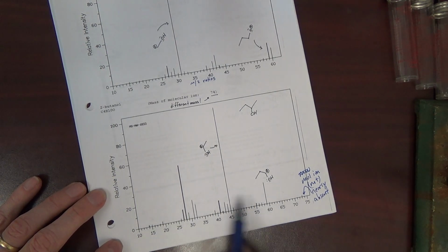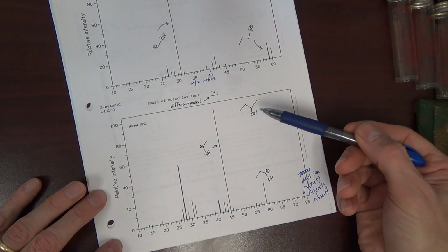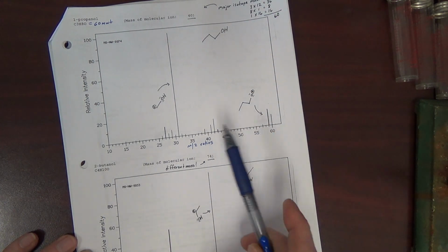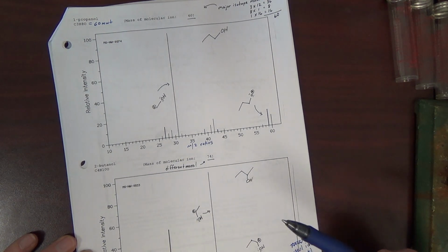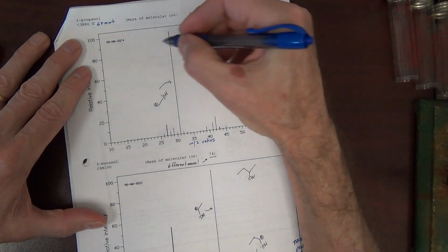Okay, the other peaks that we see here are going to be fragments that come from the original molecule. So the original molecule is 60, but when it starts breaking apart in the mass spec, and we'll talk about this, it forms lower molecular weight fragments, and these also show up. The tallest peak in your mass spec is called your base peak.